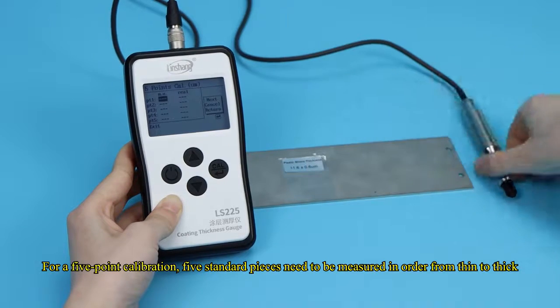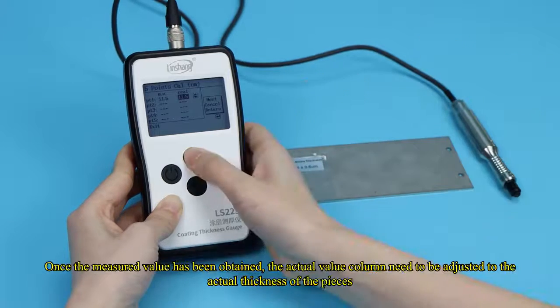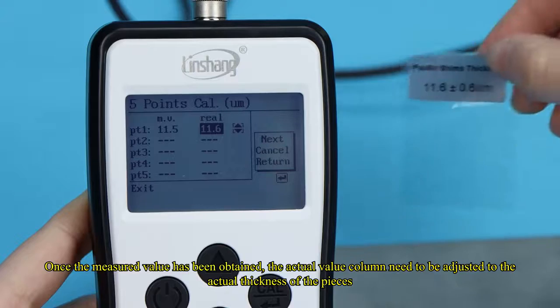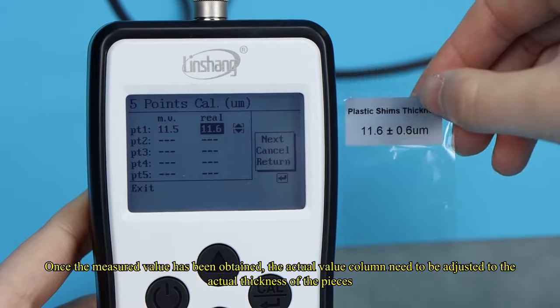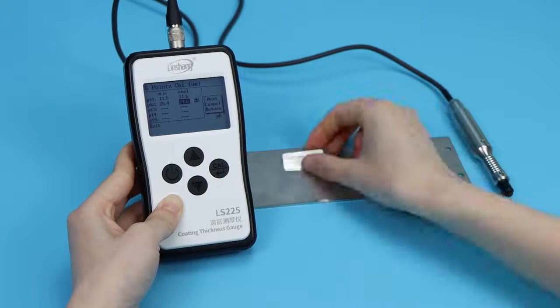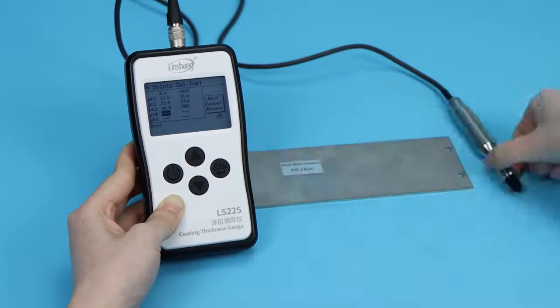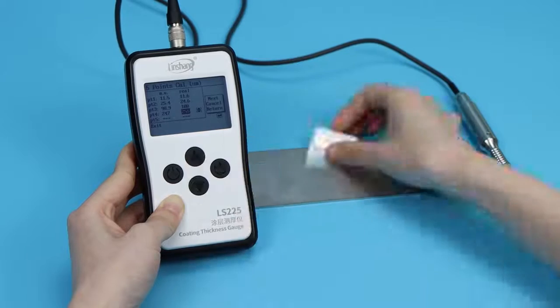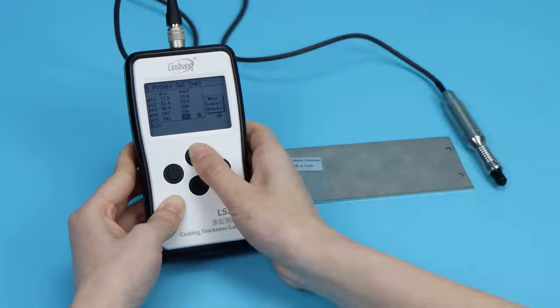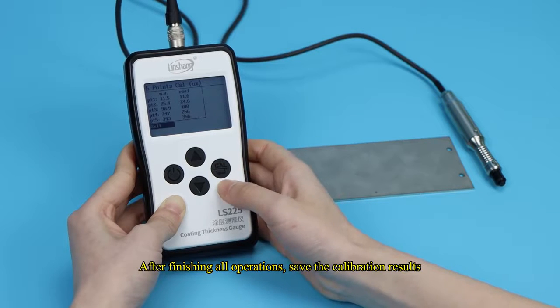For a five-point calibration, five standard pieces need to be measured in order from thin to thick. Once the measured value has been obtained, the actual value column needs to be adjusted to the actual thickness of the pieces. After finishing all operations, save the calibration results.